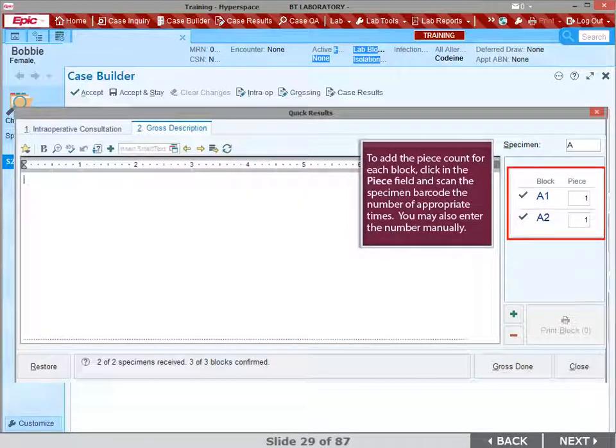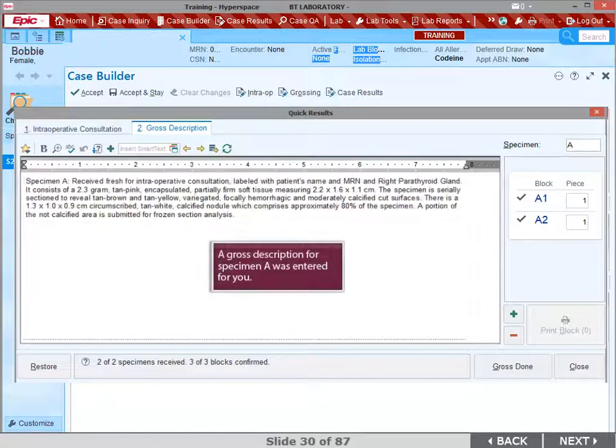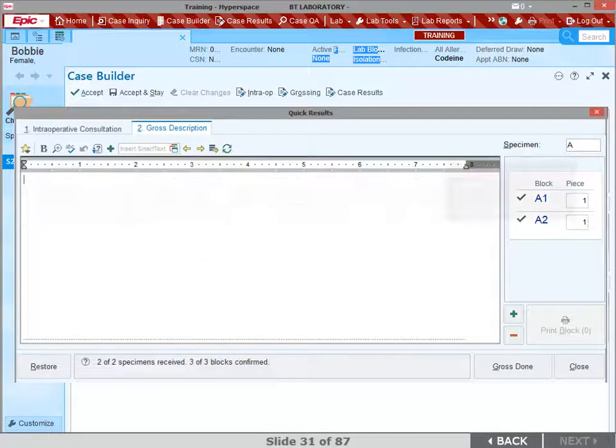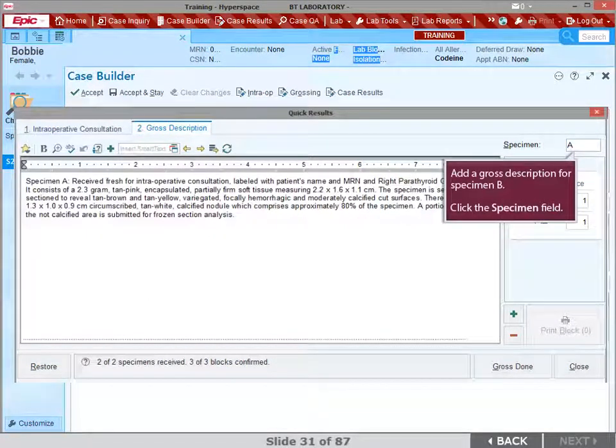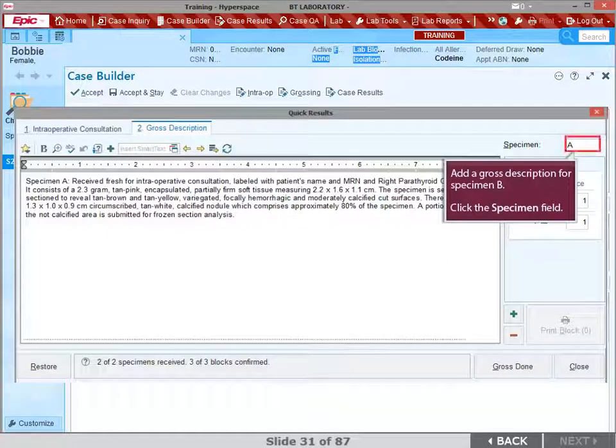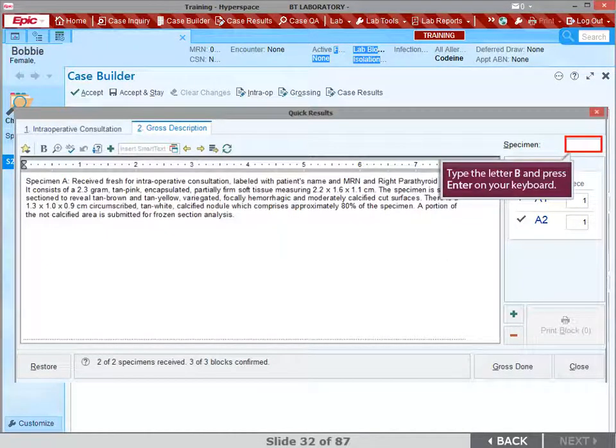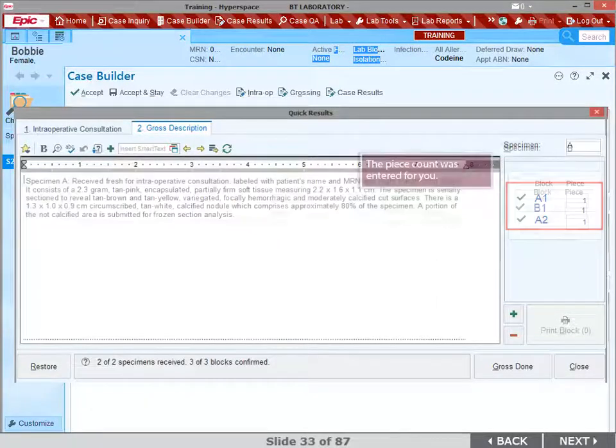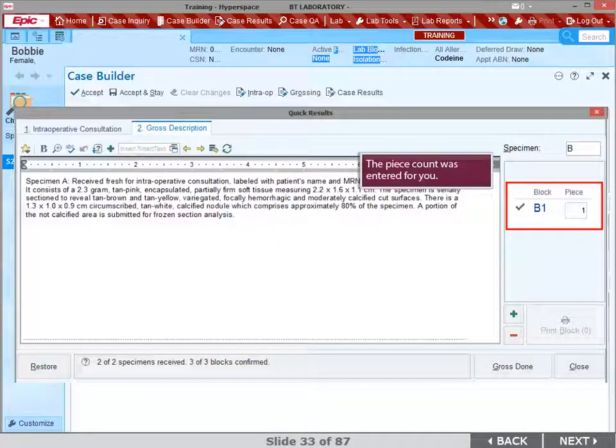To add the piece count for each block, click in the Piece field and scan the specimen barcode the number of appropriate times. You may also enter the number manually. A gross description for specimen A was entered. Let's add a gross description for specimen B. Click the specimen field. Type the letter B in the field and press Enter on your keyboard. The piece count was entered for you.